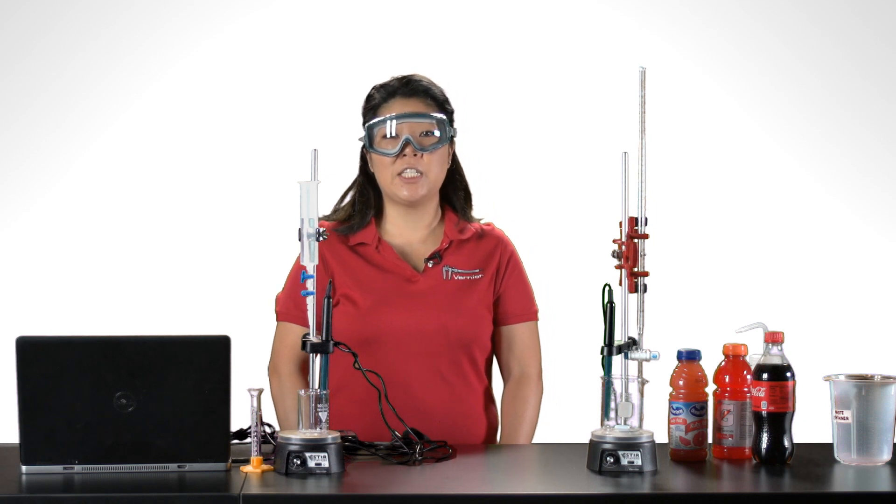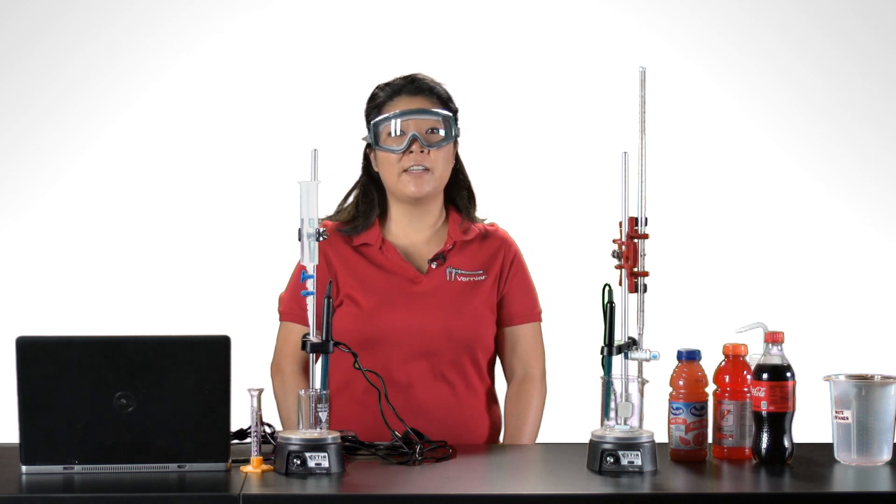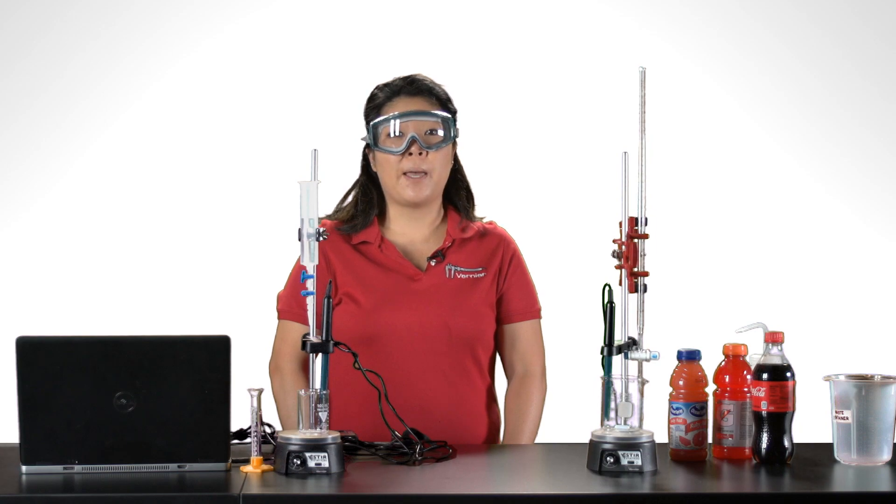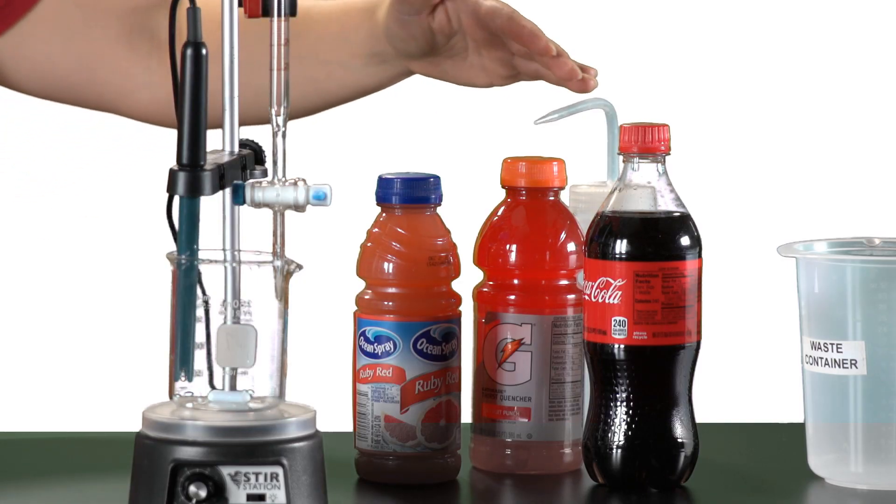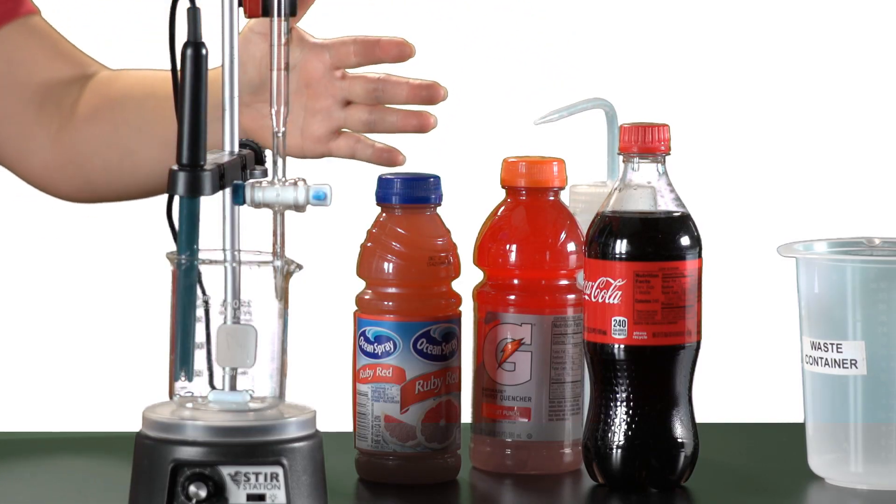The goal of this investigation is to determine the concentration of an acid in the beverage that may be a sports beverage, fruit juice, or soft drink.